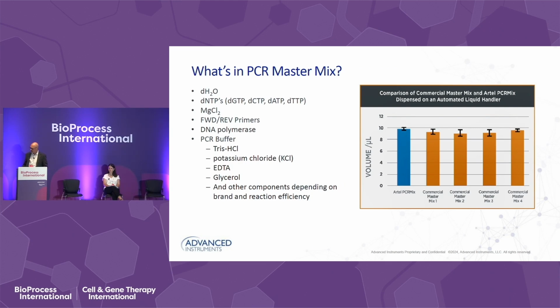In this particular slide, we're going to talk about what master mix is. It's a concentrated, complex solution of many components. Master mix reduces pipetting steps and therefore chances for error. However, it is also difficult to work with and has its own challenges.